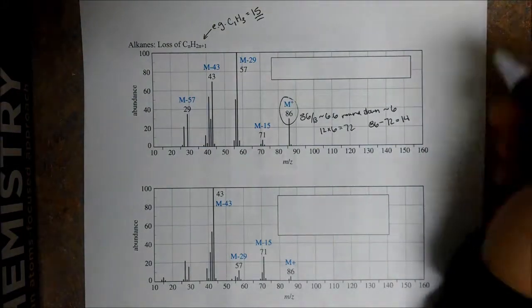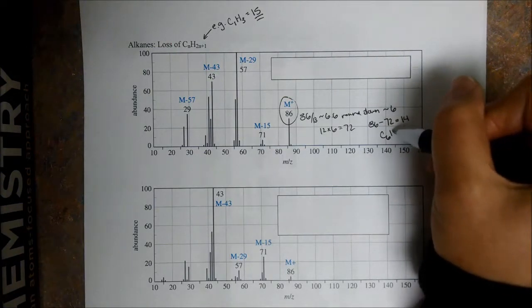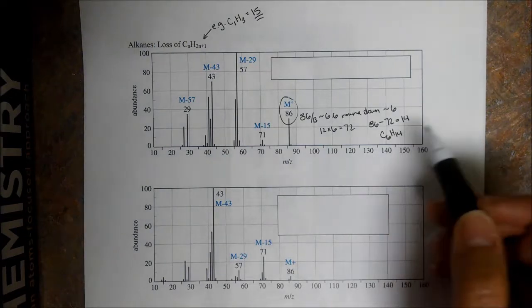Yes, kids do that math easily. Okay, so this corresponds to C6H14.